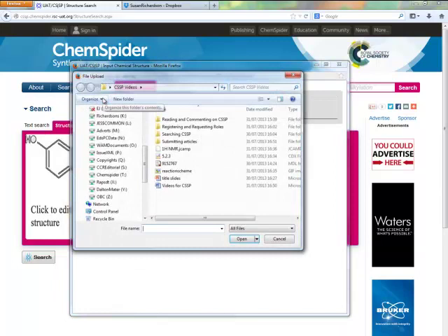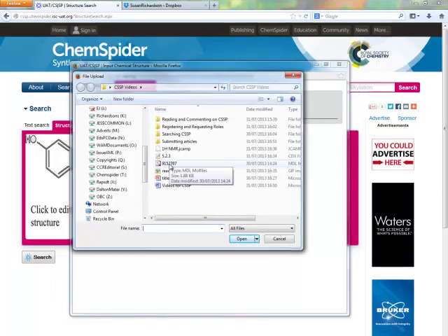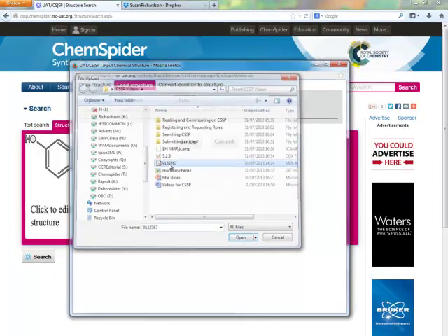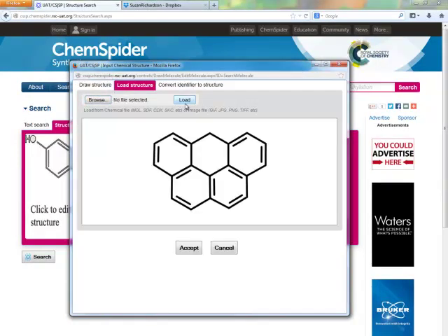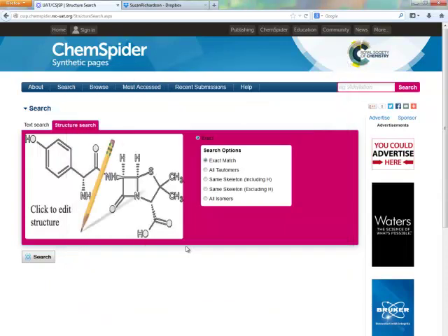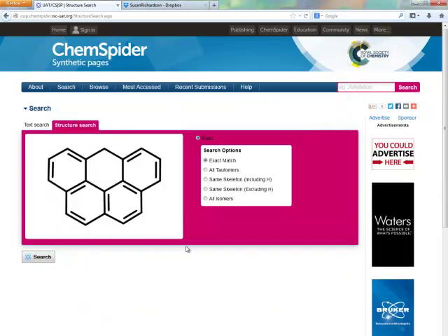You can load an existing structure file by clicking on the Load Structure tab. In this case, we're going to load the structure for 6H Benzocedpyrene, also known as Olympocene. This will filter articles where this compound is a reactant or product.